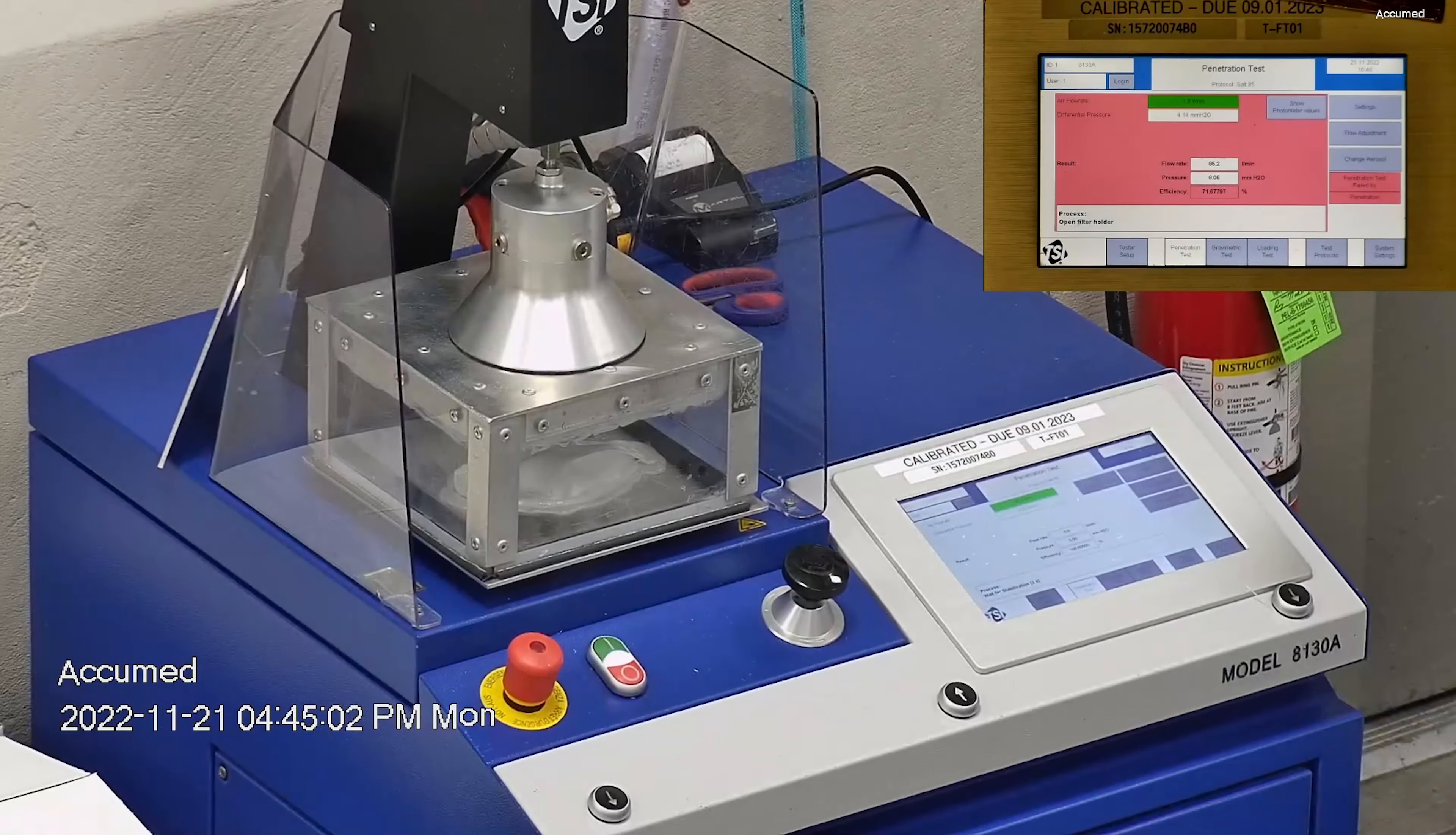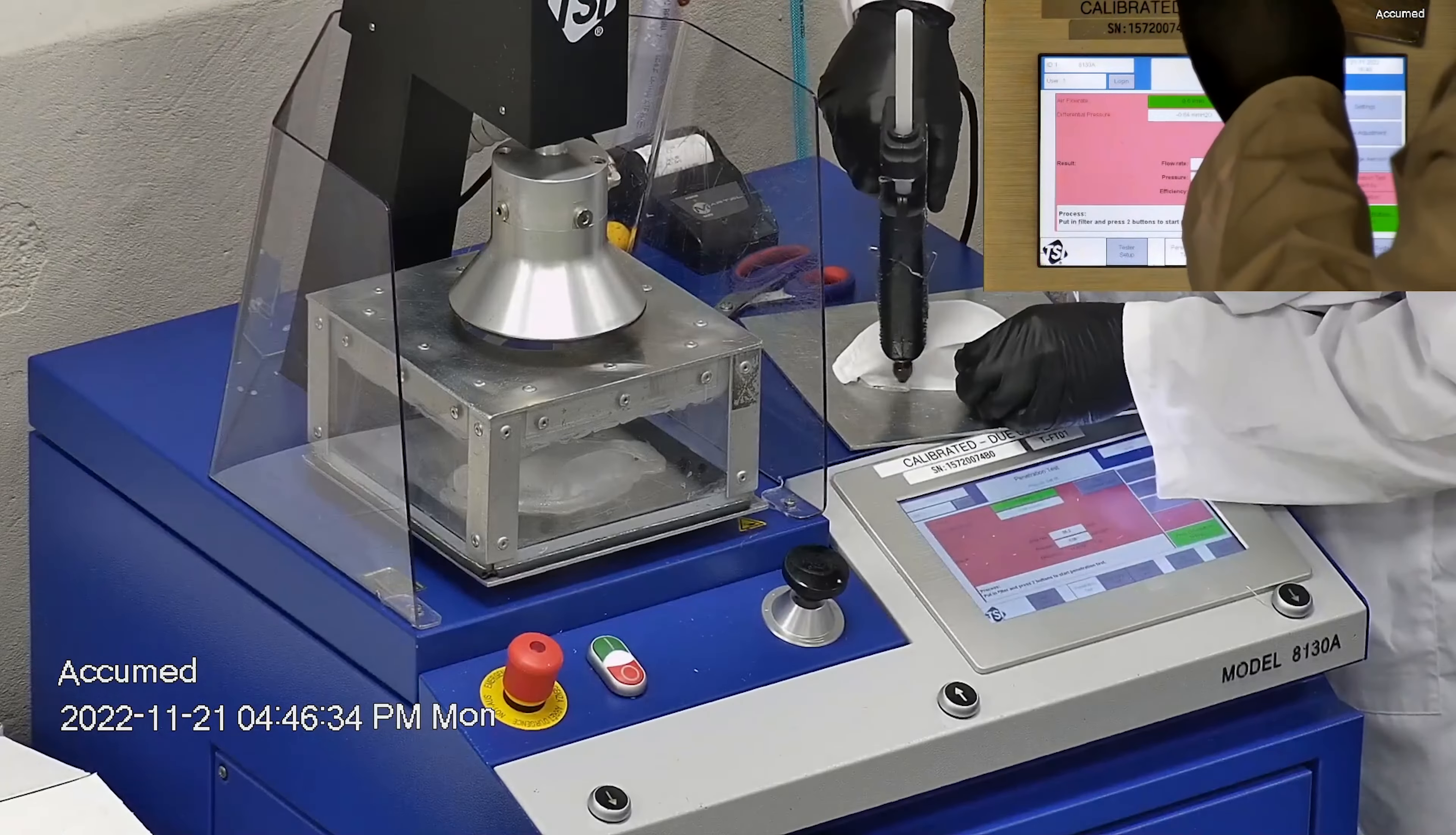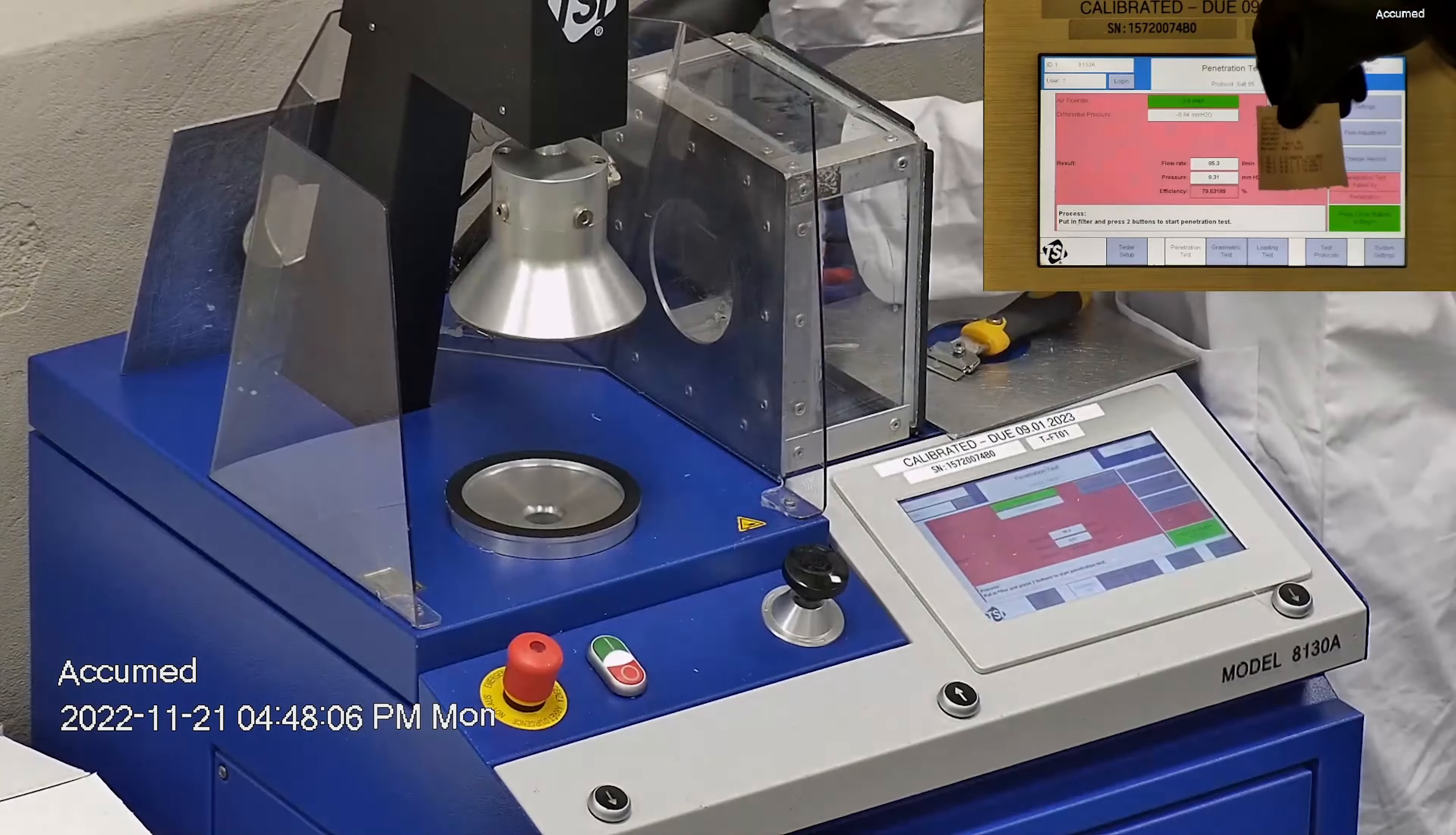The first sample had a filtration percentage of 79.7 with a pressure drop of 9.1 millimeters of water. The second sample had a filtration percentage of 71.6 with a pressure drop of 8.1 millimeters of water. The last sample had a filtration percentage of 79.6 with a pressure drop of 8.3 millimeters of water.